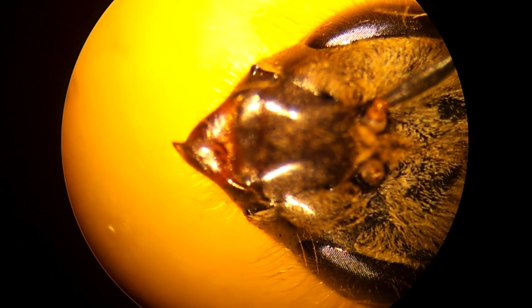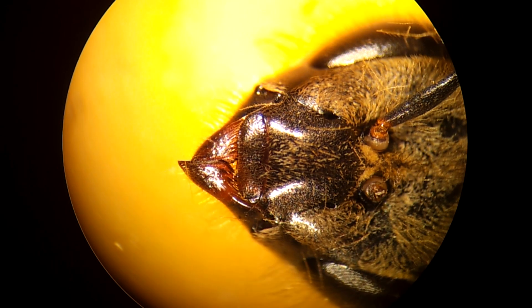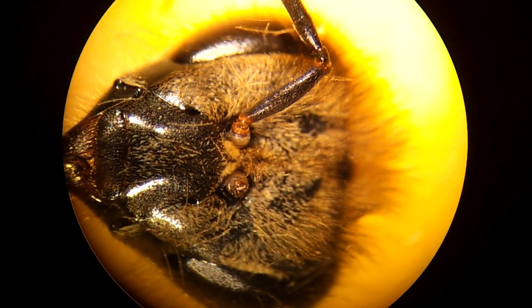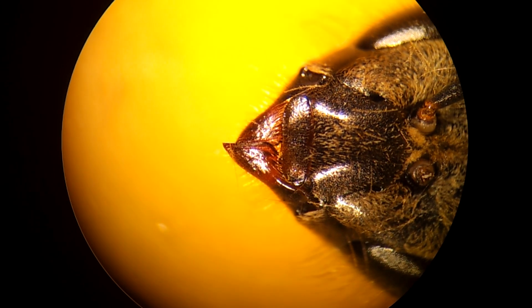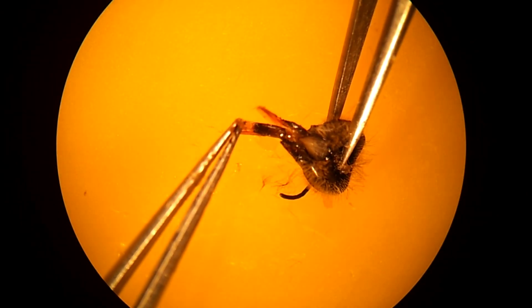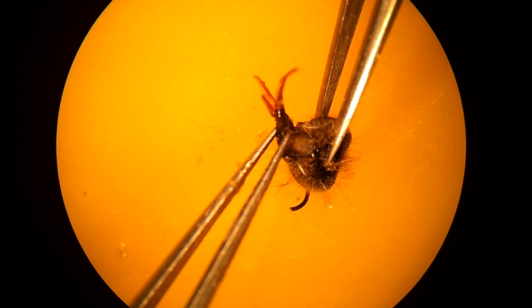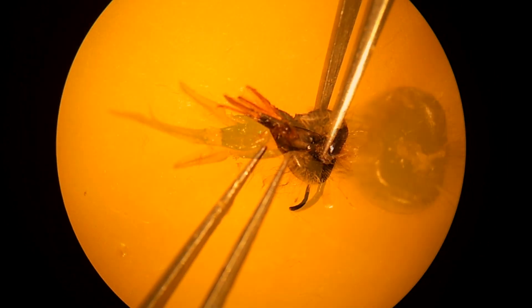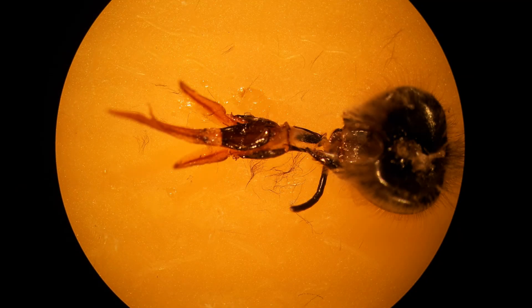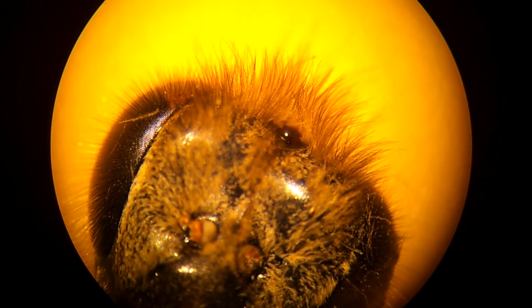They have spoon-shaped jaws called mandibles that open side to side — these are perfect for chewing and shaping wax. In order to get a good look at the mouth parts, I'm going to need to pull them off; they fold up under the head. This is often referred to as the tongue, but there's much more to it than what we typically think of as a tongue. Here's an opportunity to take a closer look at the eyes. Notice how the compound eyes have hair in the facets. And right in the center top of the head, we can get a good look at one of the three ocelli.